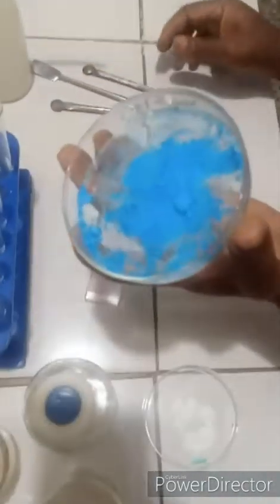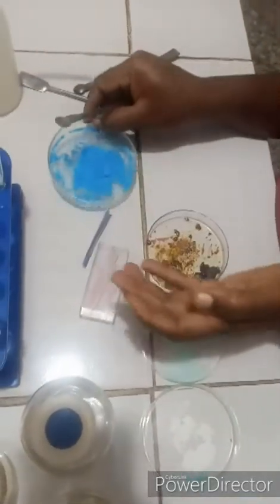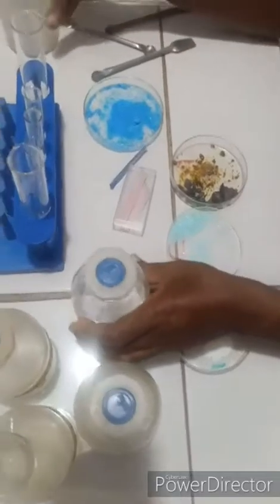Now let's move on to the confirmatory test. In our class today, we are looking at this blue salt. How do I identify the cation and the anion that make up this particular salt? In this practical, we have the following apparatus. We have our boiling tube in case we need to boil any solution. We have our test tube, then our test tube rack. We have our reagent bottles. We have our distilled water in our wash bottle.